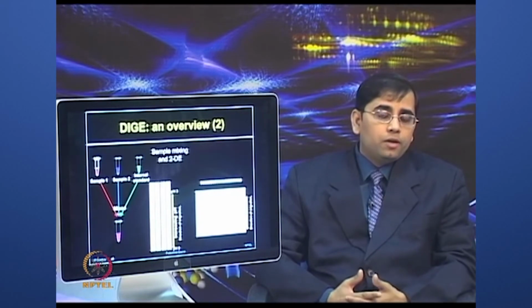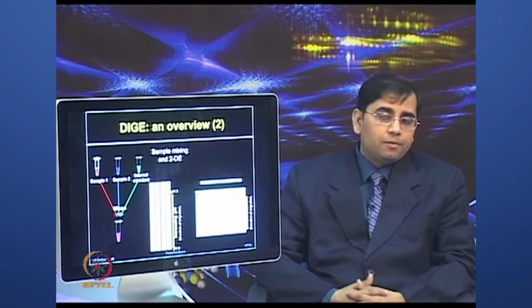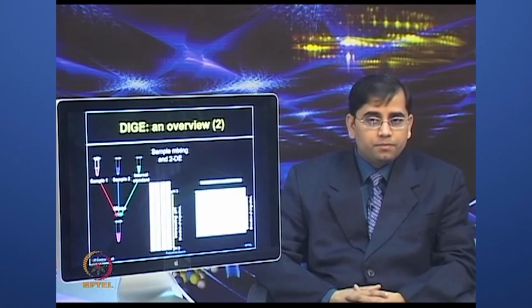So, all those artifacts can be minimized by using the DIGE approach.